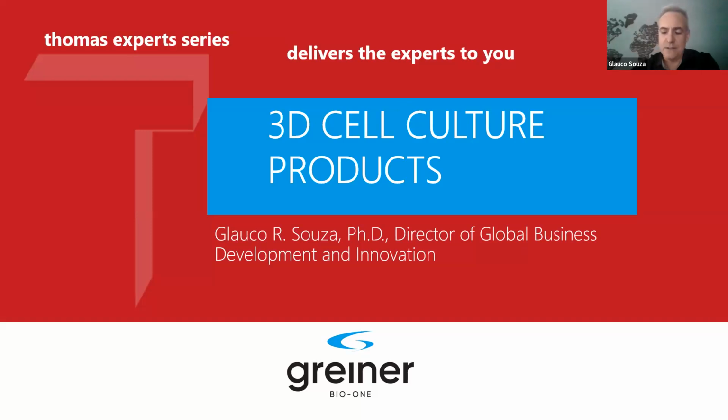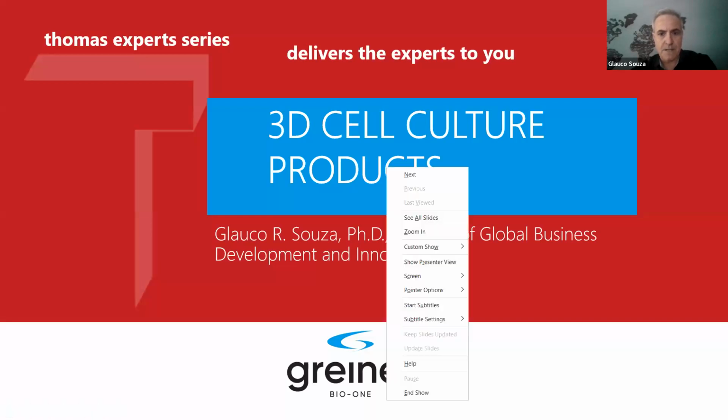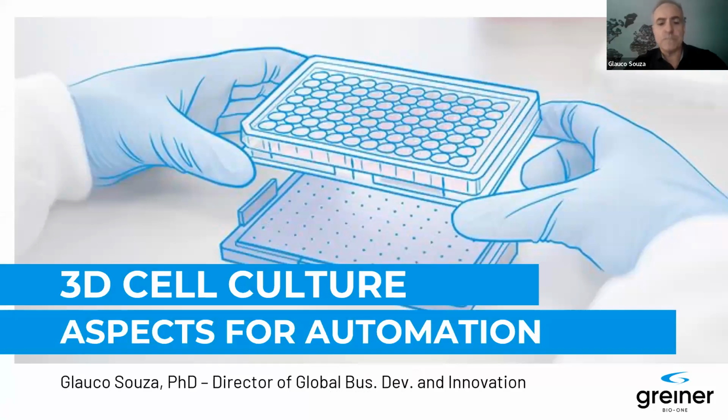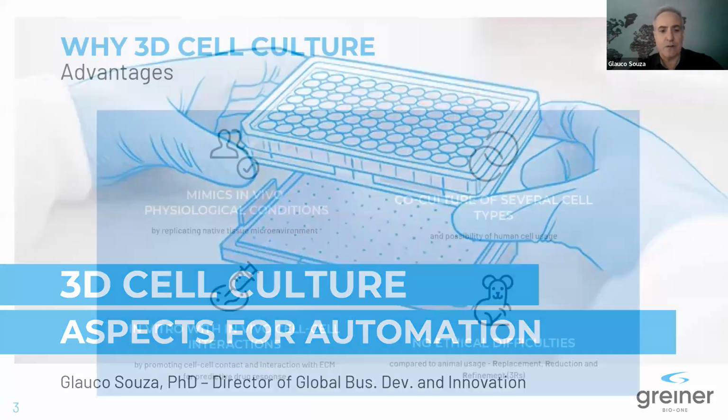So I'll be talking about 3D cell culture, but mostly I'm really going to focus on what we call magnetic 3D cell culture. There we go. As I said, we're going to mostly talk about magnetic 3D cell culture.